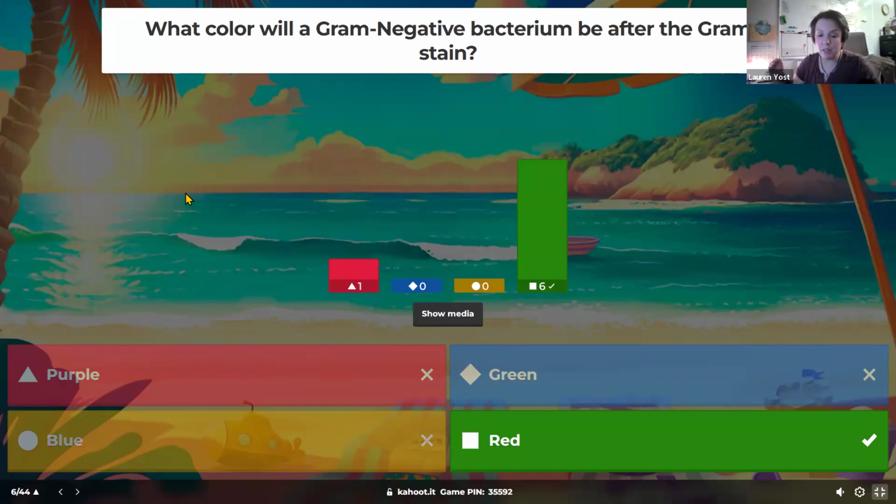On the outside of the cytoplasmic membrane, you have a wall, typically, and then the outside may have an outer membrane if you're gram negative, right? Depending on how thick that wall is, it might trap your crystal violet in there. If you have a thick wall like our gram positives have, you will trap the crystal violet and hold on to that purple color, even when you rinse it with our decolorizer, which in the gram stain is ethyl alcohol. That removes any crystal violet that didn't get locked in place by our mordant, which was iodine. And that only gets locked in place because you have a thick wall to create that meshwork for the locking in place to happen.